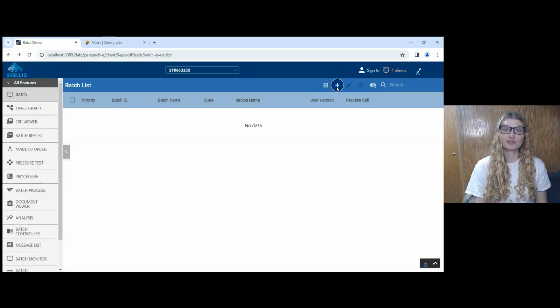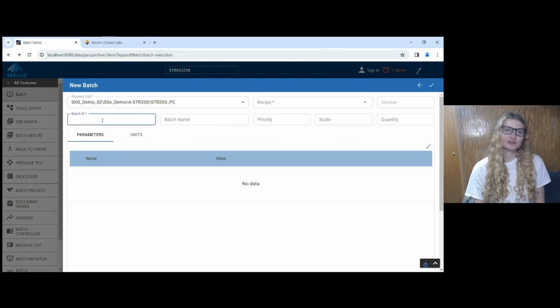So even though we added essentially a duplicate reactor that's only named different, it's able to display that with no additional cost or effort required. Talk about scalability. What's even better is this still applies even if your equipment is slightly different. That's why I let Nala name one of the reactors. My little script basically said, if STR2 something, instantiate this UDT. If it's not, kind of instantiate a random one. Very cool.